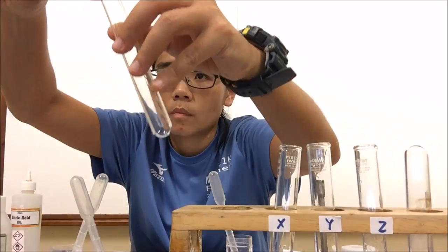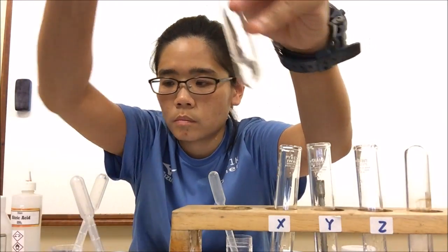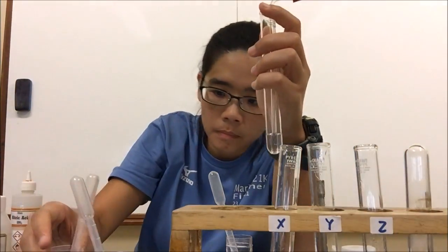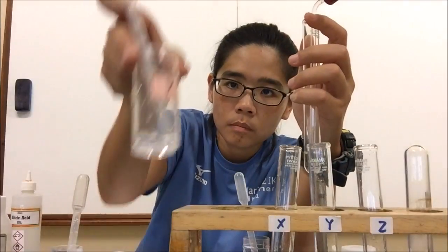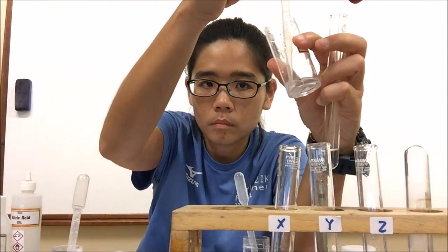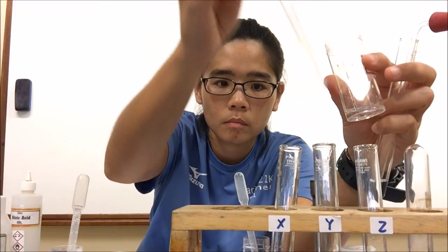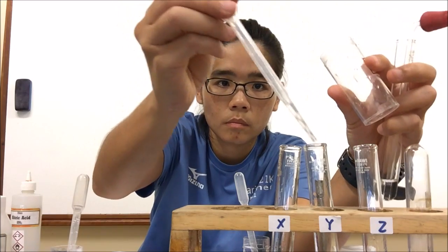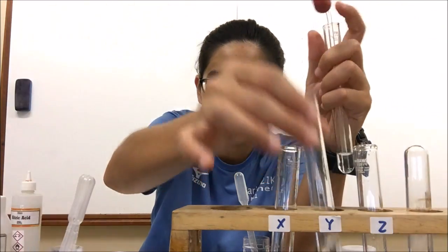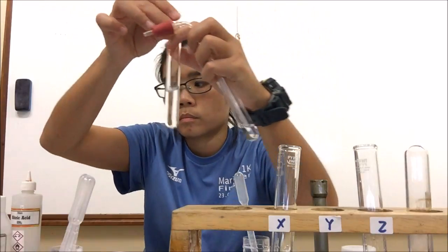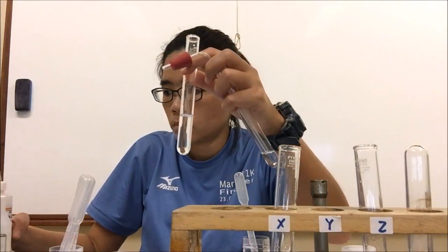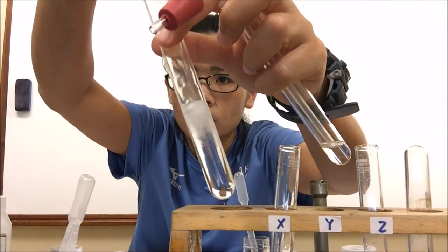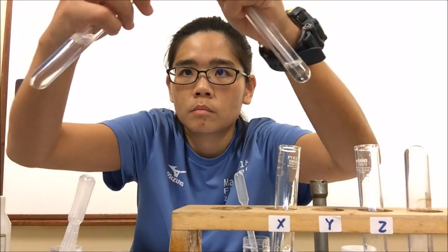I pick up the lime water and prepare 2 cubic centimeters of lime water. I add more of solution Y to generate more bubbles and more of the gas. I also add more nitric acid to generate more bubbles so that I am more likely to get a positive test. And in this case, I do get a white precipitate in the lime water. So I conclude that carbon dioxide gas was given off, and therefore Y must contain carbonate.